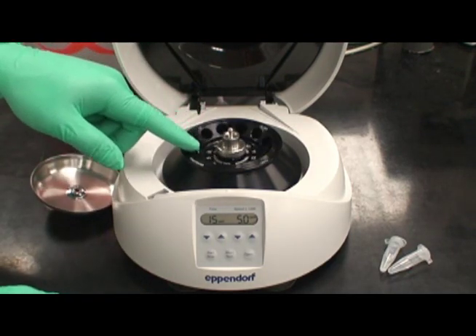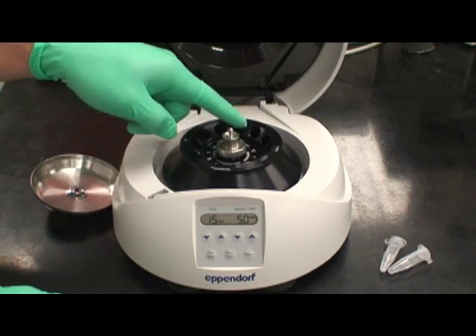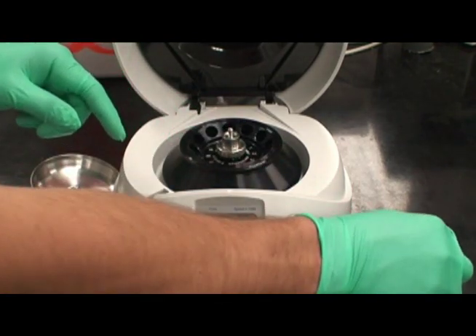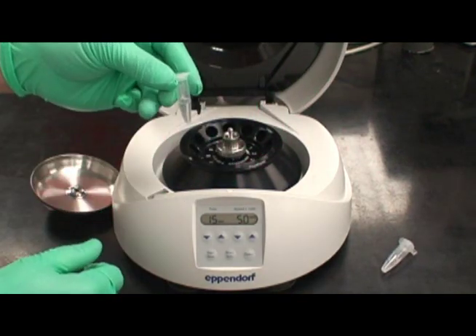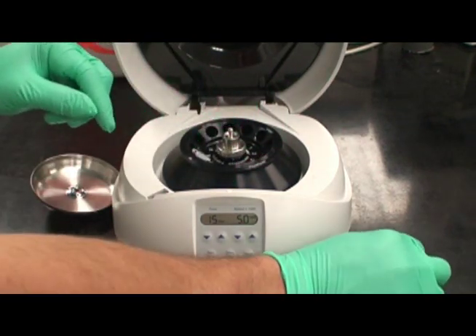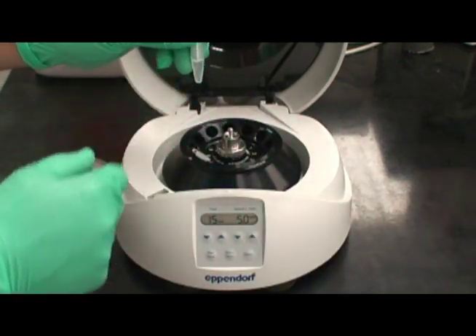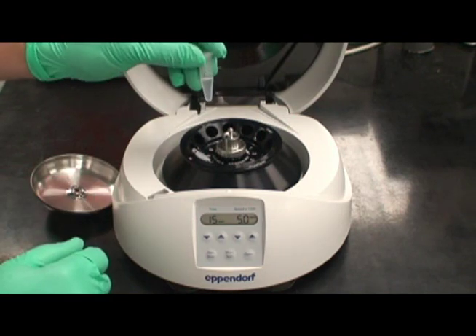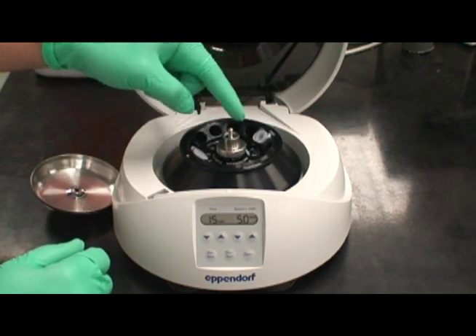Underneath the lid are various slots for small microfuge tubes. A tube may be placed in one of the holes. However, it is important to counterbalance the tube with another tube of similar contents. The tube should be placed directly across.